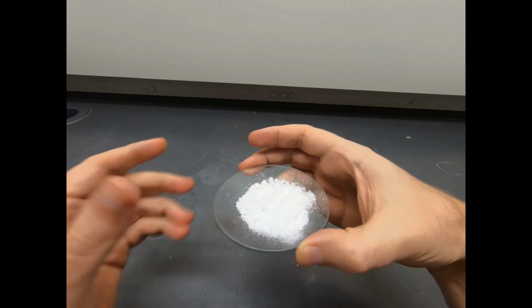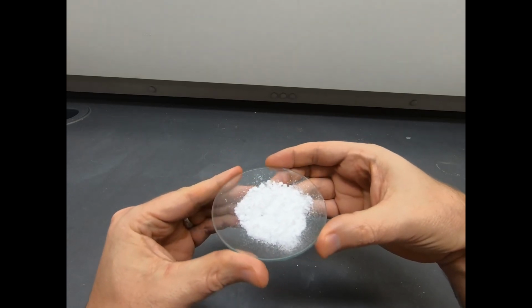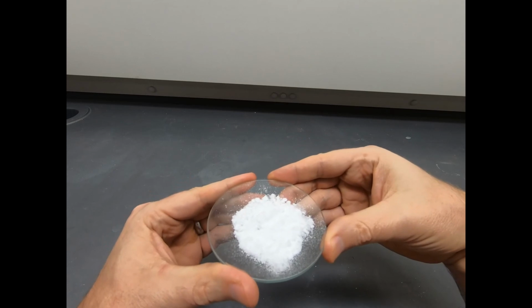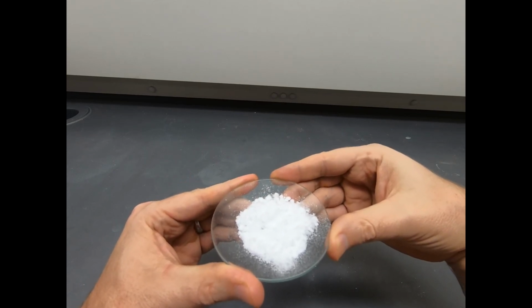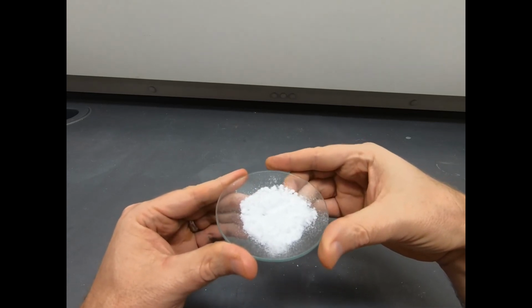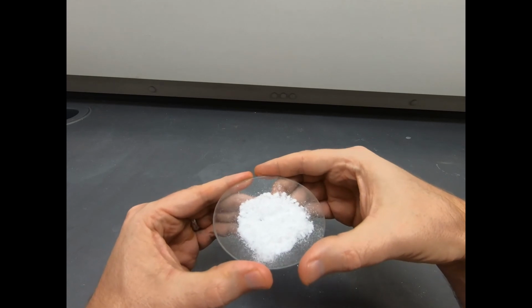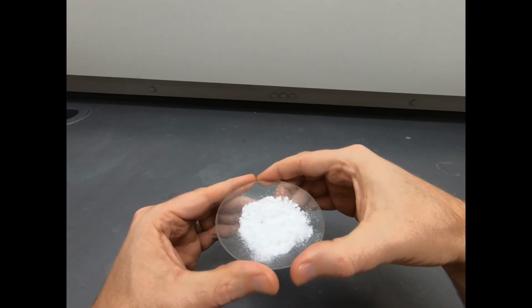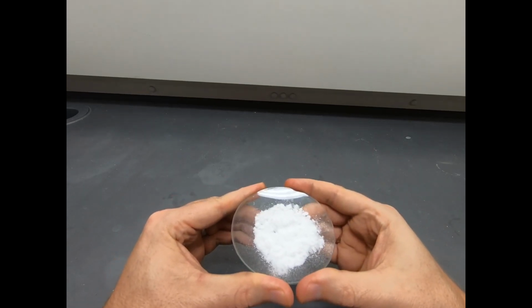Well, now this is a really nice looking solid. It's a nice, white, colorless solid, just like we'd expect pure aspirin to be, but we still need to gather NMR data, and we'll want to gather some melting point data on this compound. So anyway, initially it looks like about 20 to 25% yield, or 20 to 25% recovery. You know, we didn't actually make anything. All we did was recover material from the pills.